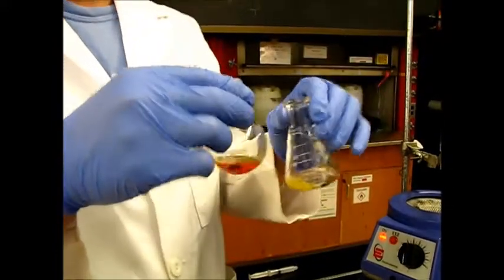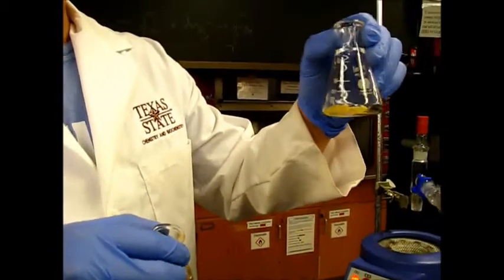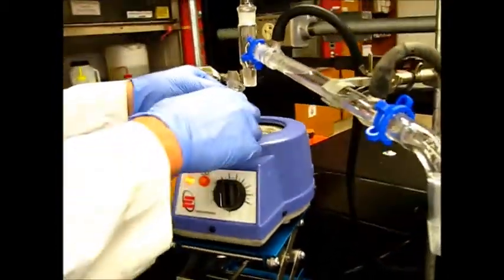So I just finished pouring out just the liquid part from here. This is all that's left. This is all the sodium sulfate clumped up with all the water. So we'll set that off to the side and put this into our simple distillation.